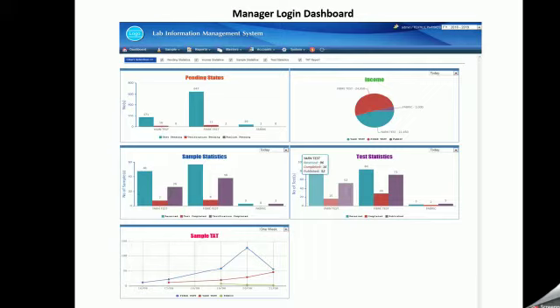This chart shows the income generated by different labs for a specific period. Third, TAT, turnaround time. It estimates accurate turnaround time starting from the sample receipt to reporting of results to clients. This chart shows the performance of each lab by calculating the time taken from sample receipt to publishing of tests online. It will help managers further analyze the delays.